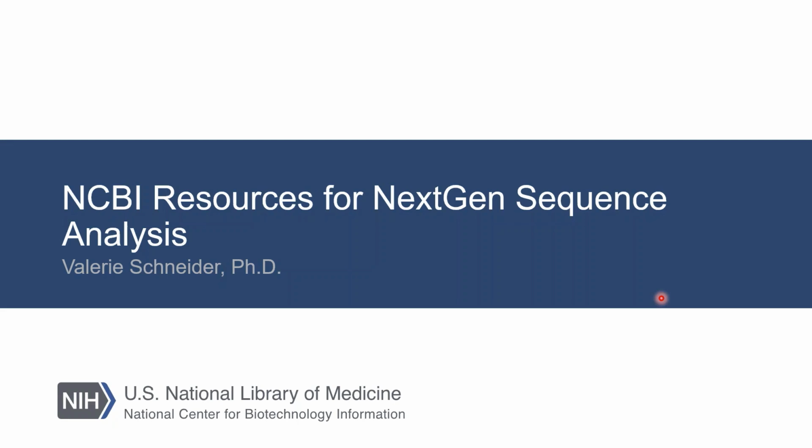Thanks, Peter. And I want to welcome everyone to this afternoon's webinar. As Peter said, my name is Valerie Schneider, and I'm a staff scientist here at NCBI, who leads various teams that are building tools for sequence visualization and analysis. So today, in this presentation, I'm going to be introducing you to a few tools that are useful for analyzing and visualizing some next-gen sequencing datasets.